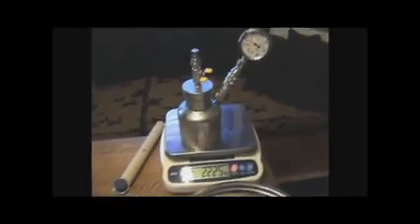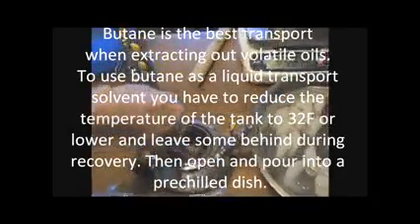Using this extractor tank and column and this recovery tank. If you don't want anything added to your butane during extraction but you also don't want a gooey mass in the bottom of your tank after the butane has been recovered, you might add a transport solvent. I add a little bit of secondary solvent to this tank prior to getting started — I just added 50 milliliters.